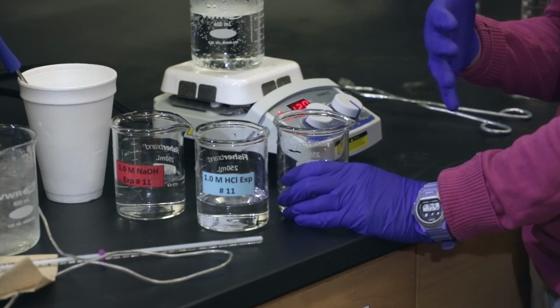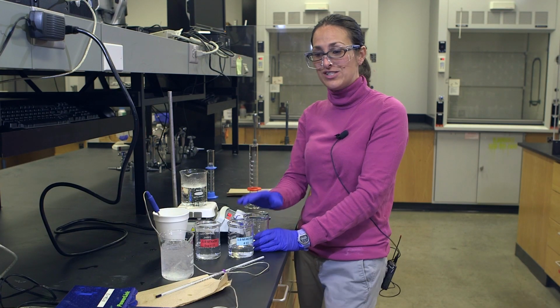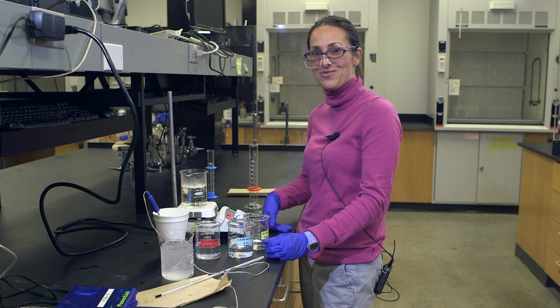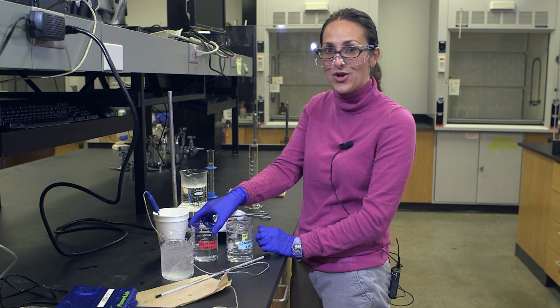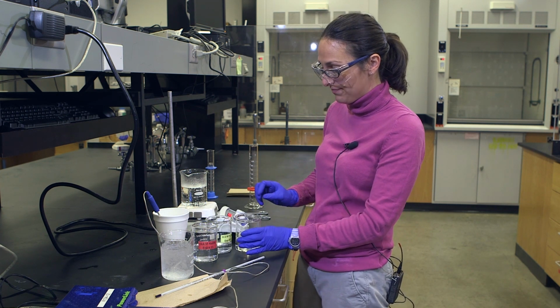Make sure you're not wearing your nicest clothes because the acid is corrosive, and we used to joke in graduate school that you could point out a synthetic organic chemist because they had a row of holes in the t-shirt they wore to lab because of all the nasty spills on the counter. And we don't want that to happen to you, so make sure you're wearing clothing that you don't mind if there is some damage to them.